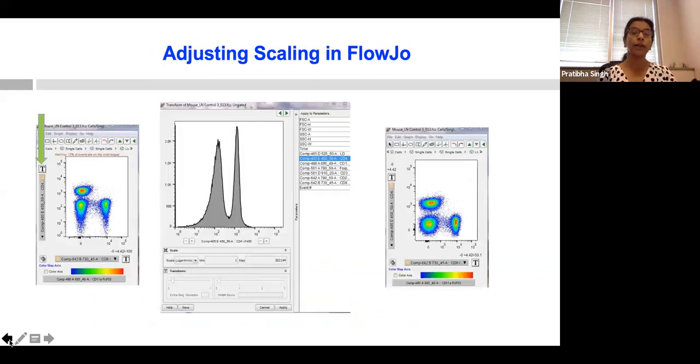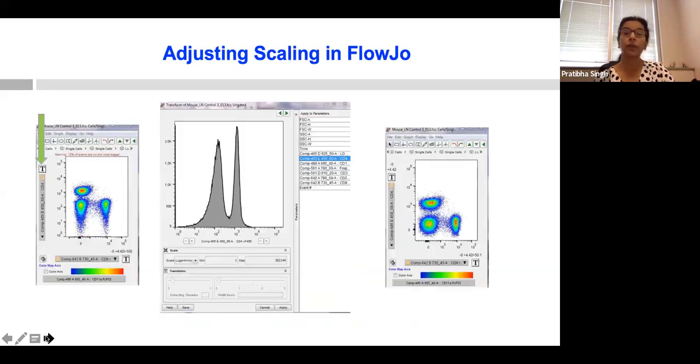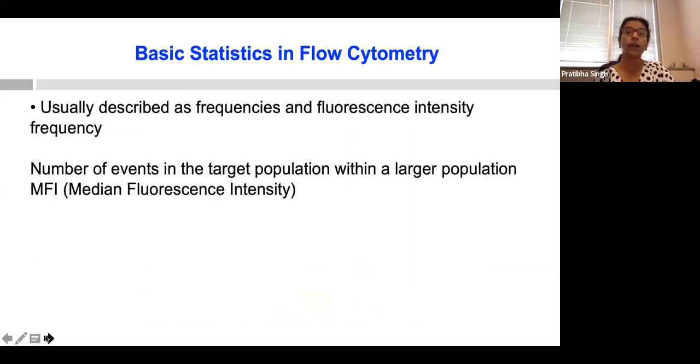These are the criteria when you are analyzing the data. In addition, when you're analyzing, you should decide whether you want to scale the plots. There is a way to do that in the FlowJo software. Then when you have your data, the results can be shown as the frequency, or as the actual number of cells by multiplying the frequency with the total cell count.